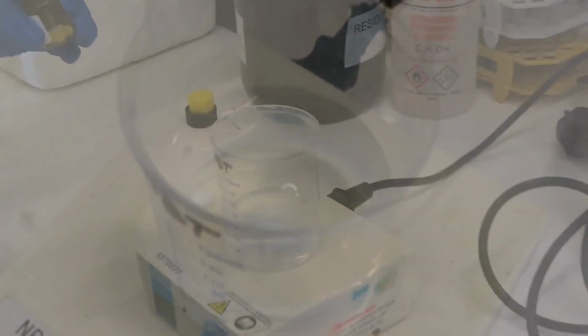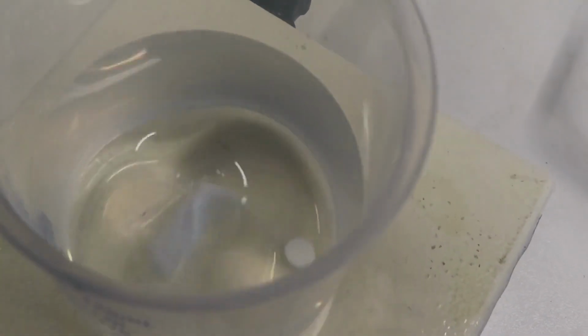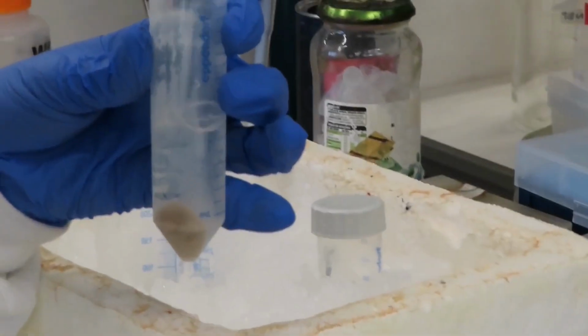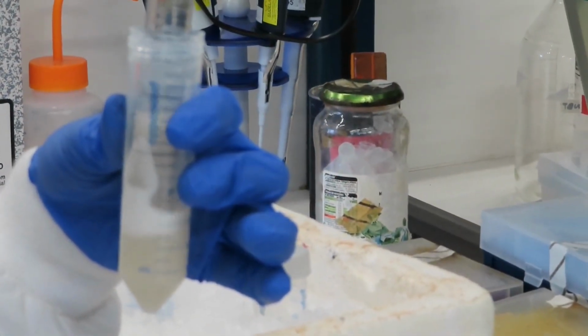The effect of these inhibitors only lasts a few hours, so it's very important to keep the sample refrigerated as much as possible to diminish protease digestion. The pellet must be very well resuspended in this buffer, trying to dissolve all cell lumps in order to have a more homogeneous cell lysis.